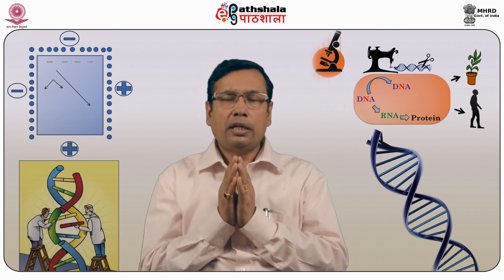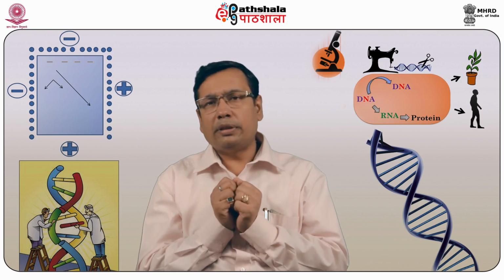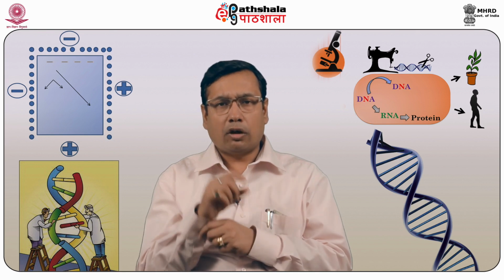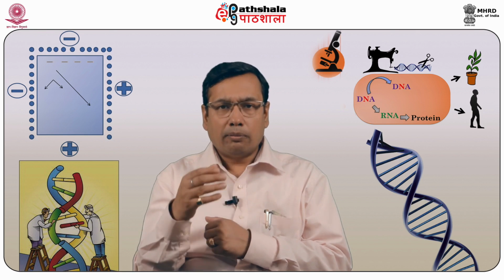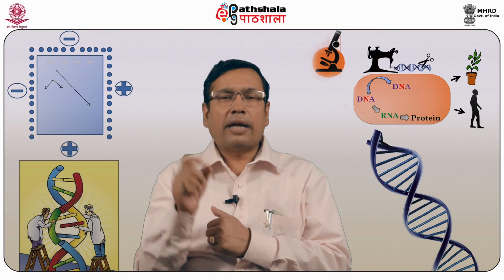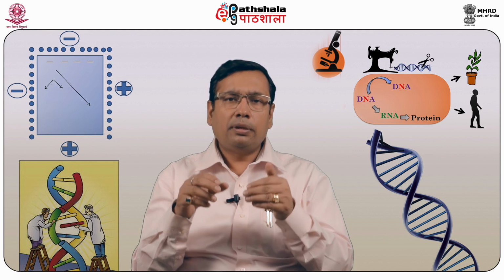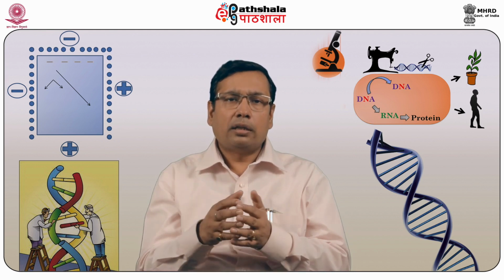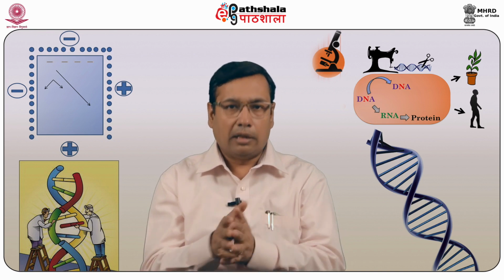The most important is magnesium chloride, because suppose a DNA has low copy number and in the end you are getting a very faint product or faint amplicon, you can enhance this efficacy, I mean the amplicon product, by adding some magnesium chloride. Magnesium chloride enables better binding, and you can have in the end a better product. But apart from the better product, you will have many other non-specific bindings as well.